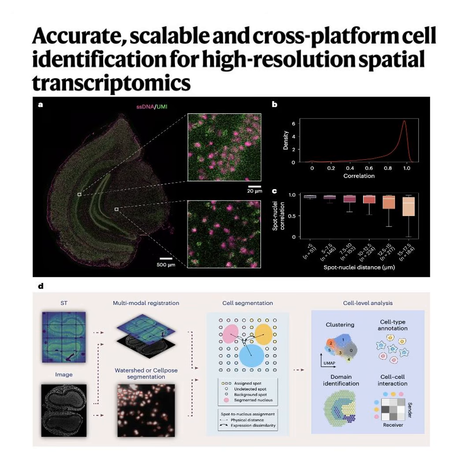That brings us to A in our NAP mnemonic. Align. Multi-modal registration. This is where so many tools fail. You have two entirely distinct layers of data, right? The spatial RNA spots and the actual stained image of the tissue. Exactly. Cellist uses a tool called Spatial to align these modalities. It performs rigid affine transformations. Rigid affine transformations. Okay, let's unpack that. It just means it can translate, rotate, and scale the two layers until there is a pixel-perfect overlap. But it does this without locally warping or stretching the biology. So it preserves the true physical distances between everything.